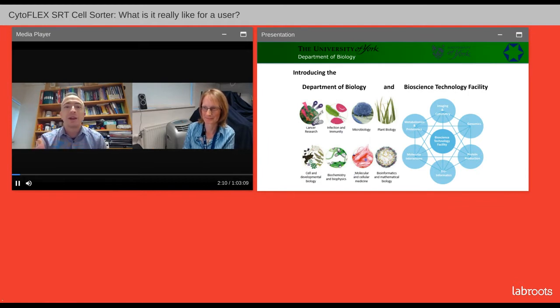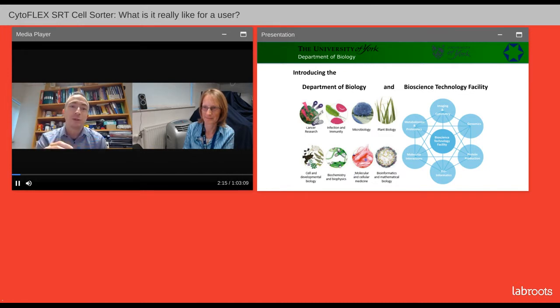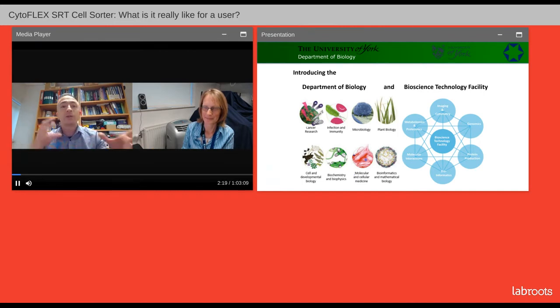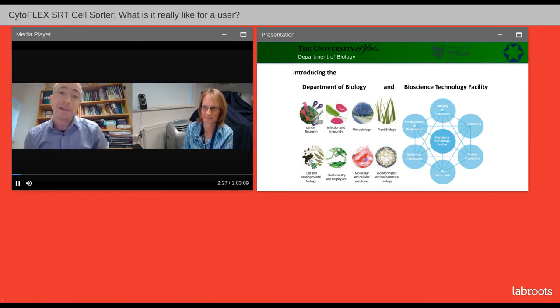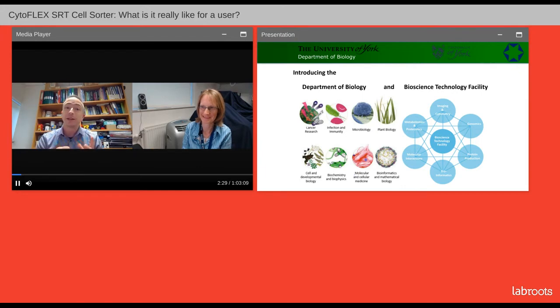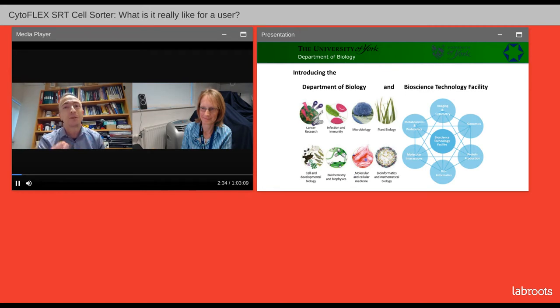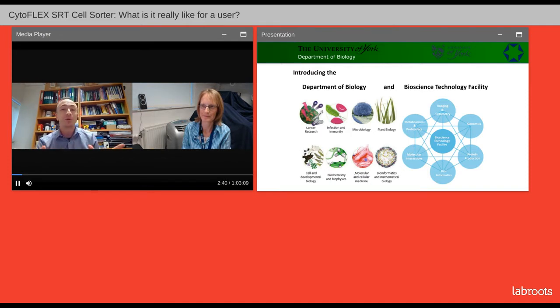This is going to be a very different type of presentation. I have some slides we'll go through at the start, but then we are going to go live to the instruments. We'll set it up live, and whilst it's going through its protocols, we'll come back to the slides. Then we will hopefully do a live cell sort and show you that it is sorting exactly what it's telling us it's sorted.